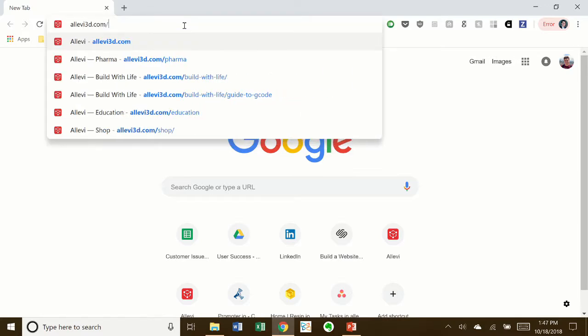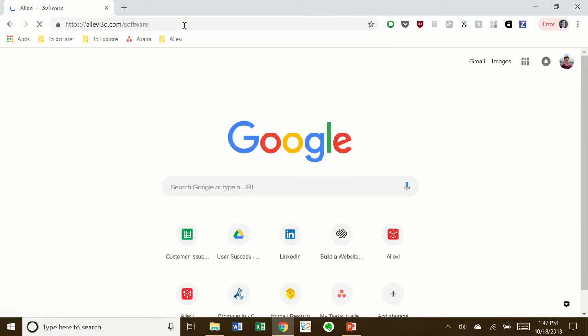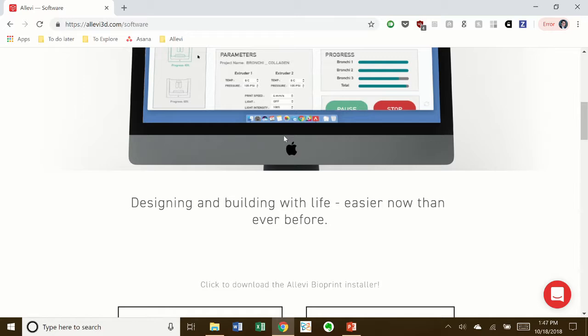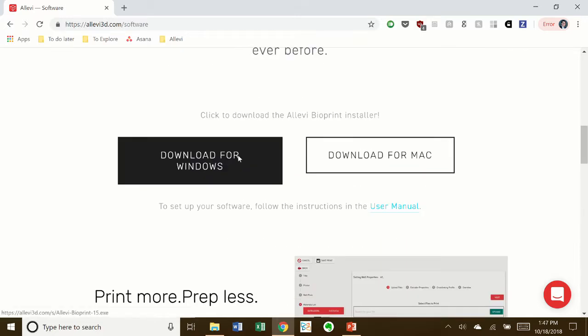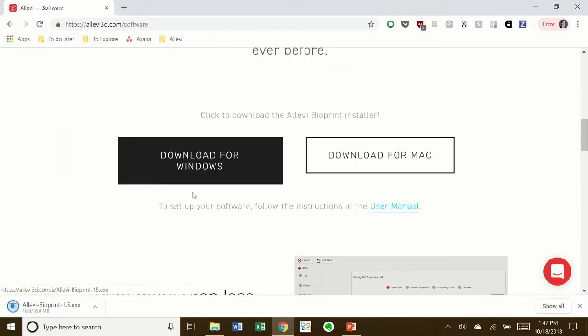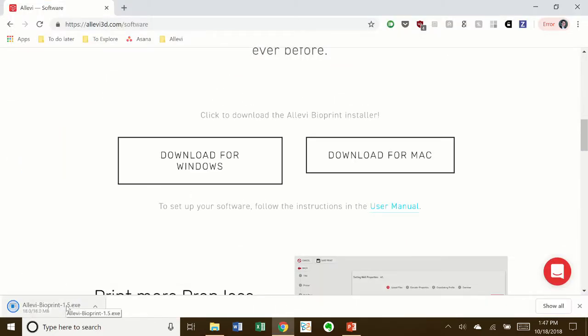To install the latest software, go to the software page on your Allevi website and download the installer for your operating system. Once downloaded, double-click to run.